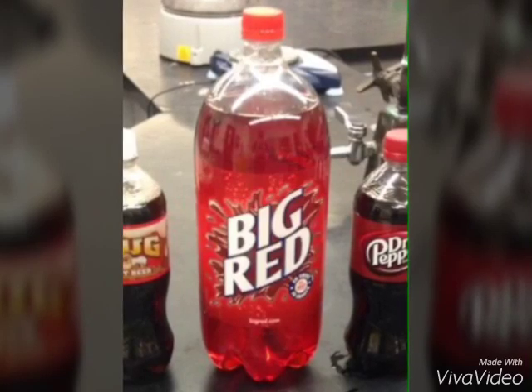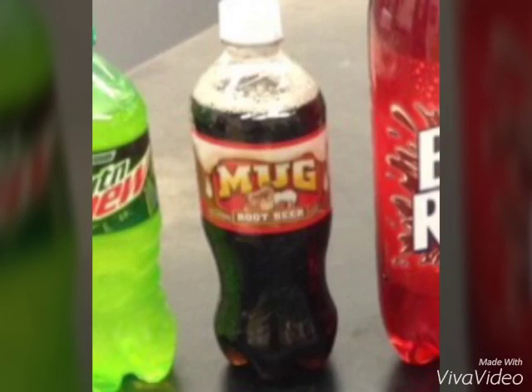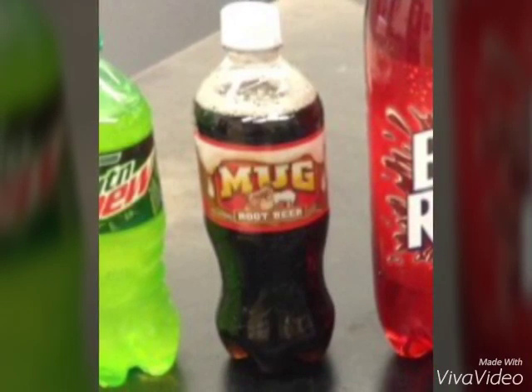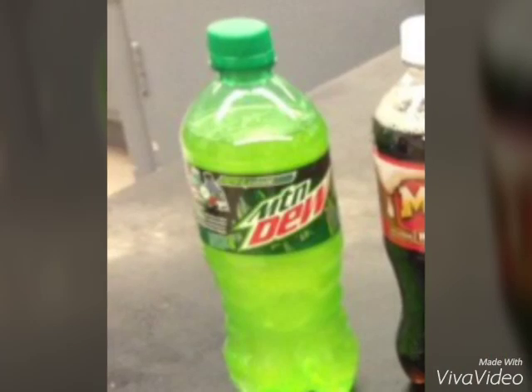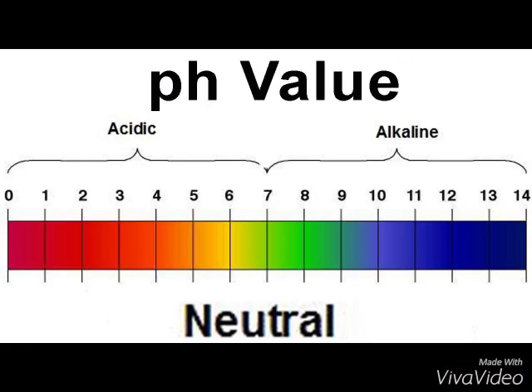Big Red's pH increased by 0.12 over the 15 hours. The root beer's pH decreased by 0.78 over the 15 hours. Lastly, the Mountain Dew's pH decreased by 0.01 at the end of the 15 hours.